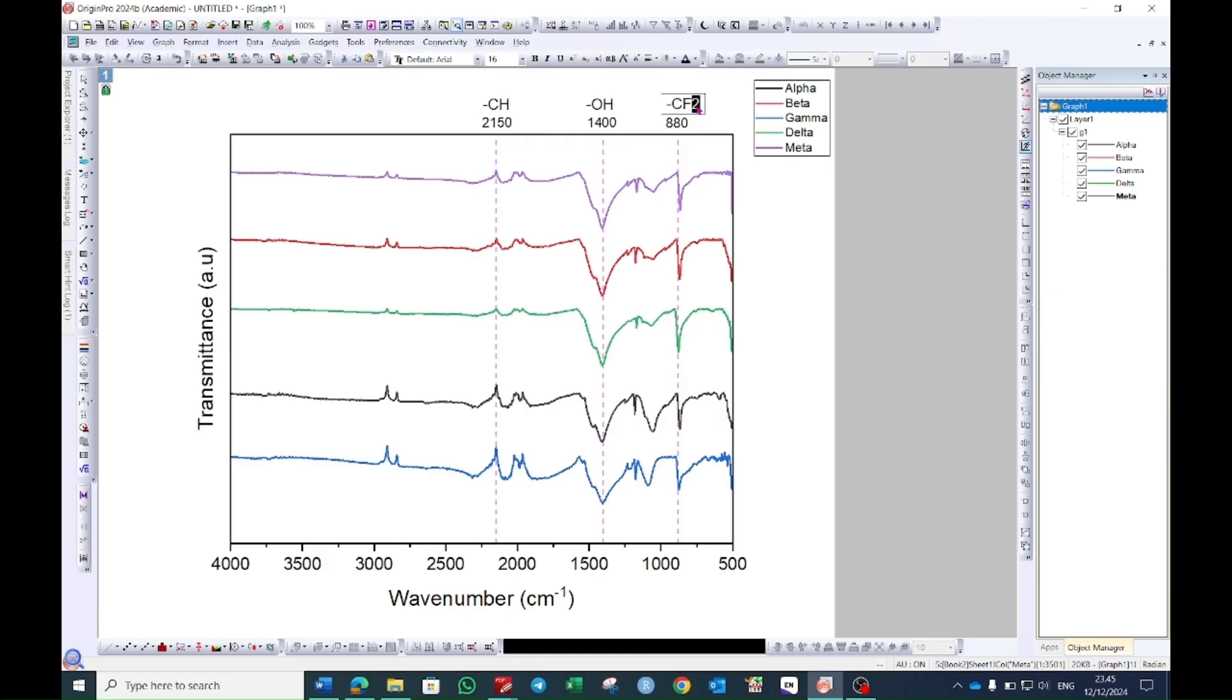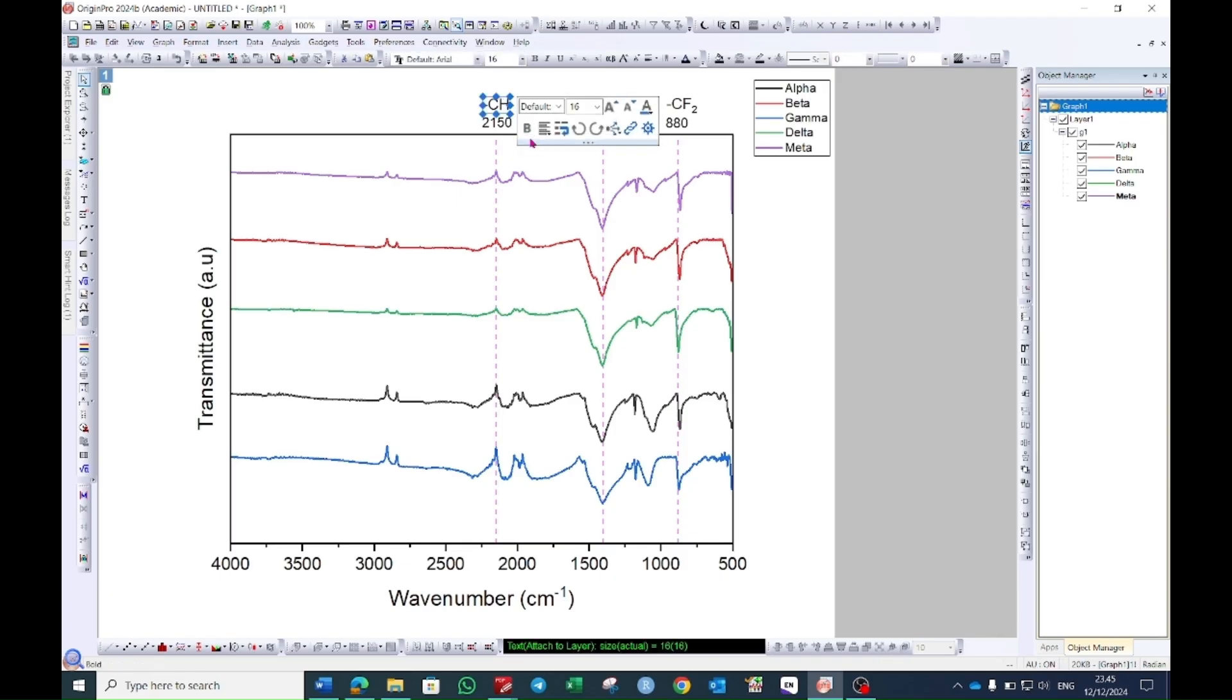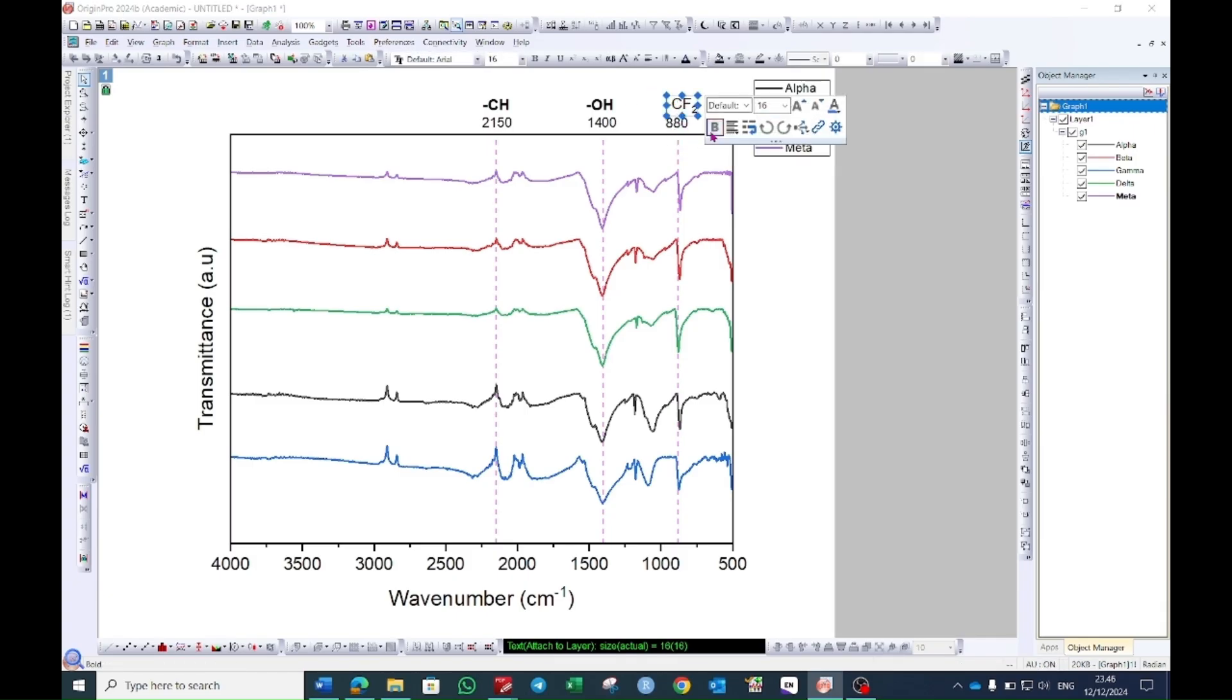If you want to make it a small subscript, then you can see here it says subscript. Just click on this and it will make it a subscript. Then you can select this one and here you see a bold option. You can click this one and it will make them bold. You can do the same with all of the peak values.